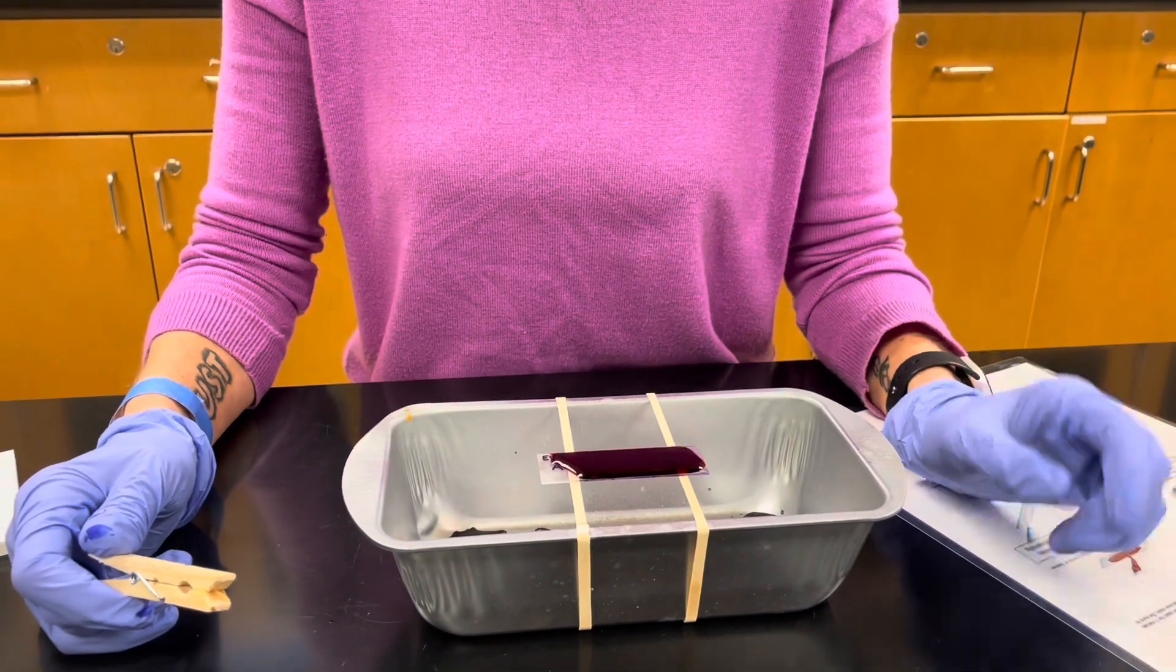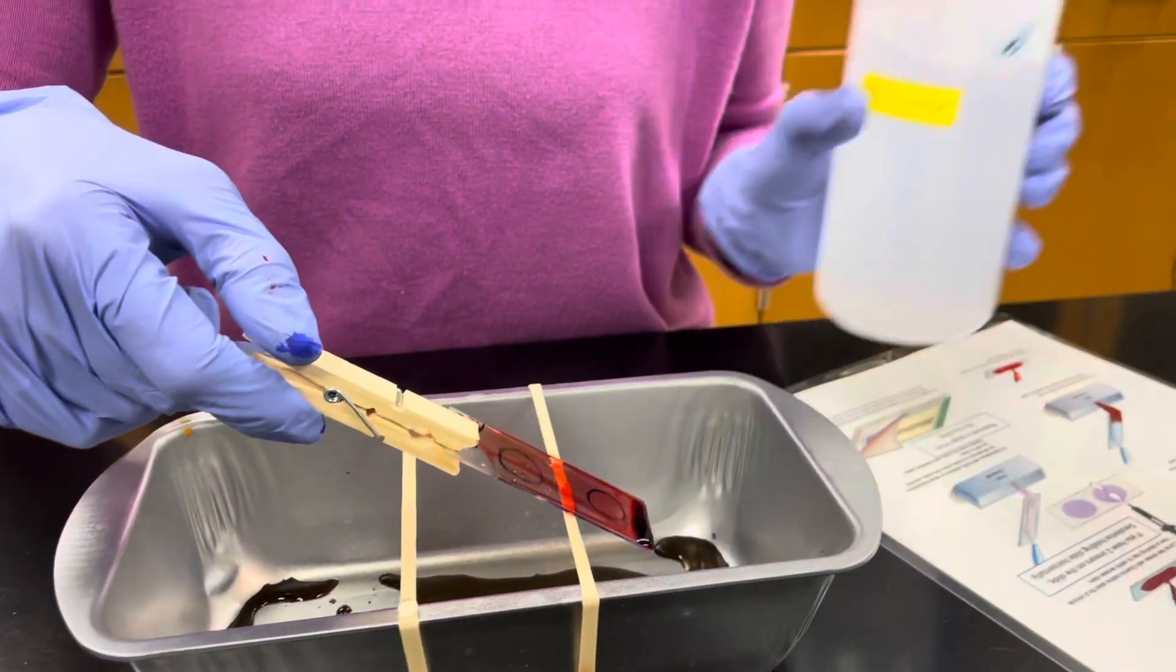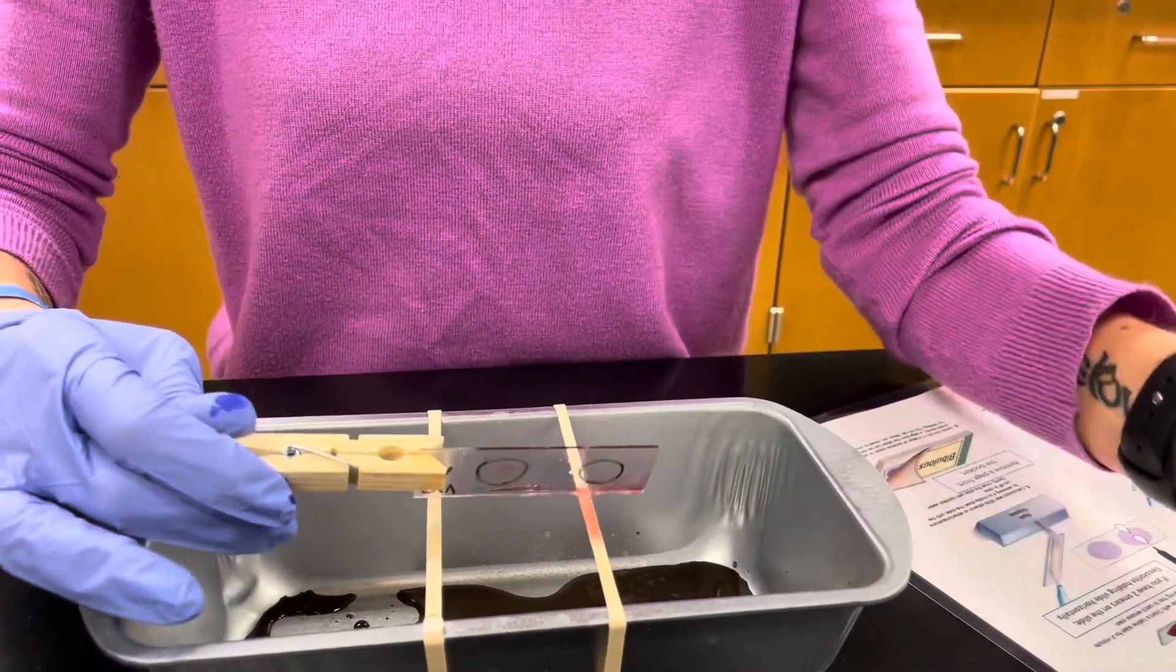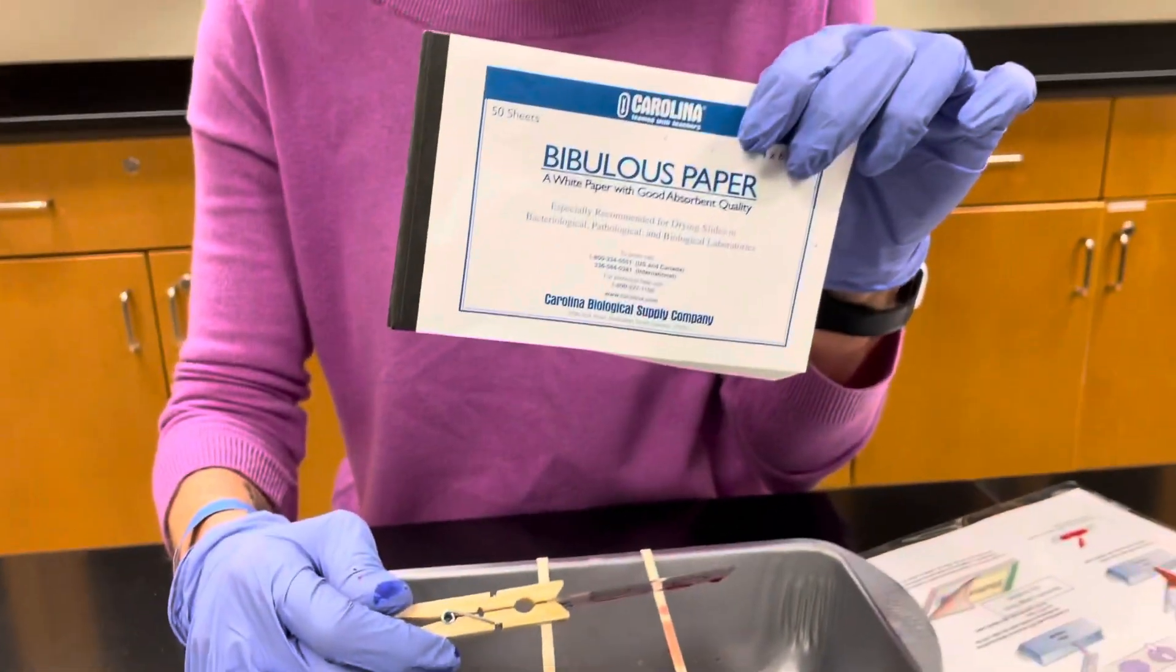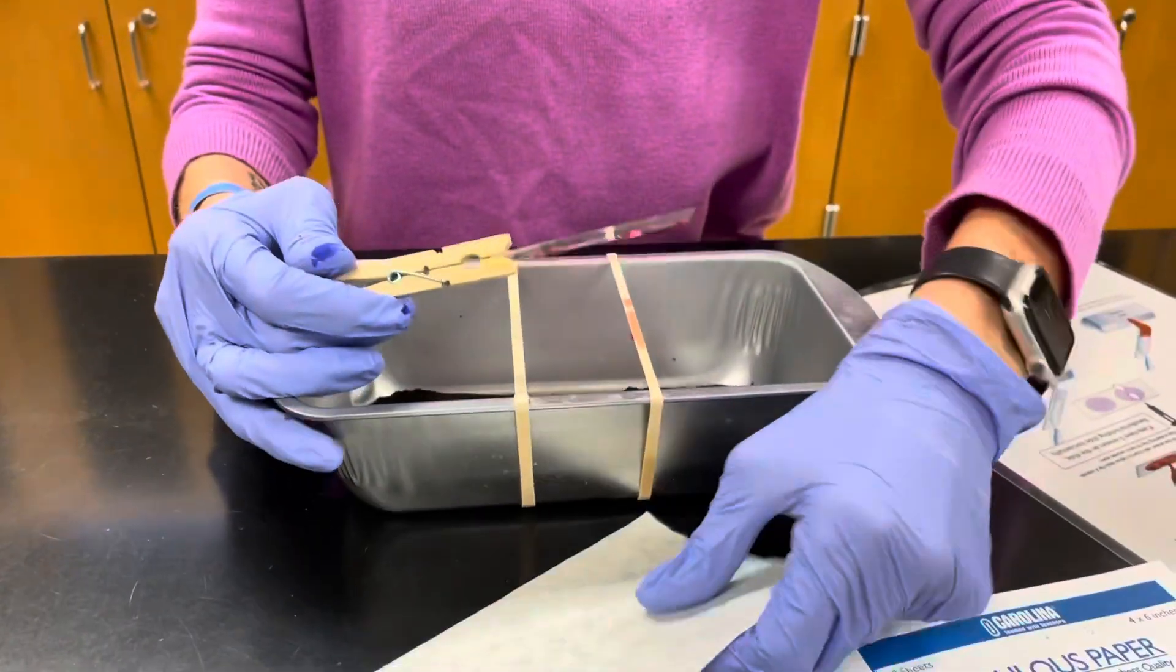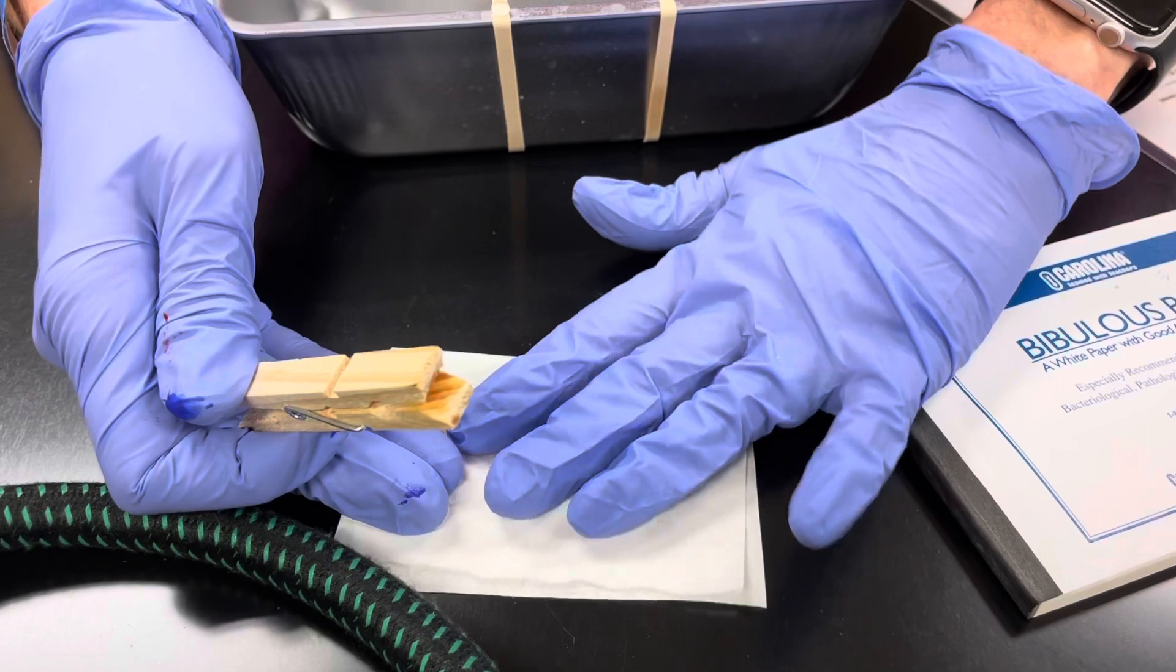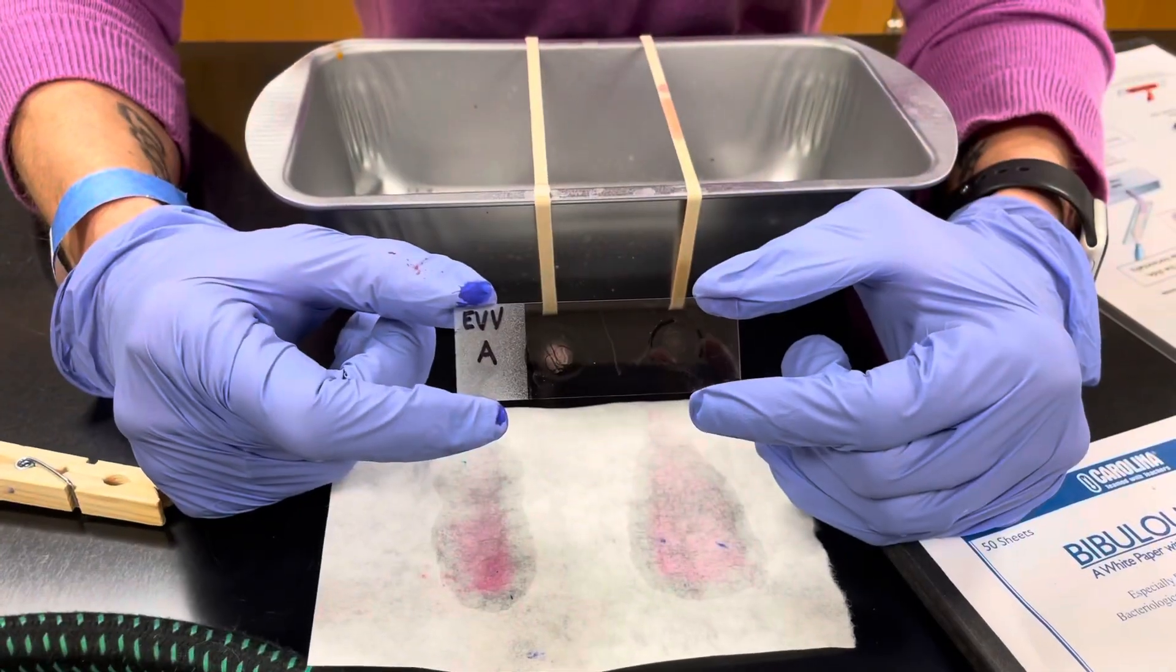The last thing you need to do is rinse off your secondary counter stain, the safranin, and you rinse it off using water just gently. Tap the excess and then we're going to blot it with bibulous paper. So go ahead and just remove one sheet. Place your slide on the bibulous paper and then just blot it gently to dry. Once your slide is dry, it's ready to view.